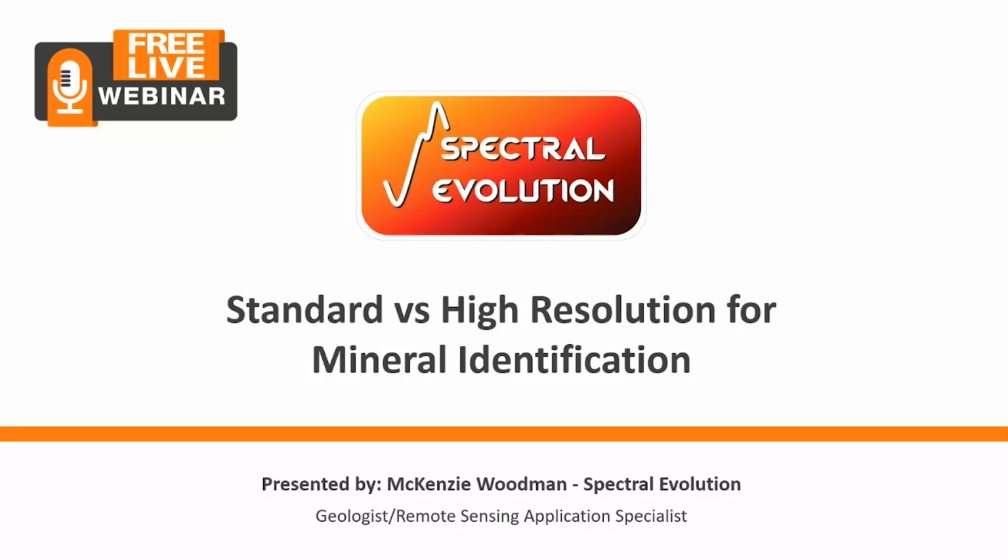Today, we're going to be talking about standard versus high resolution spectra for mineral identification. It's a relatively short webinar, and we're going to be discussing how standard versus high resolution spectra is used across industry and why it's important. So I guess we'll just get started.